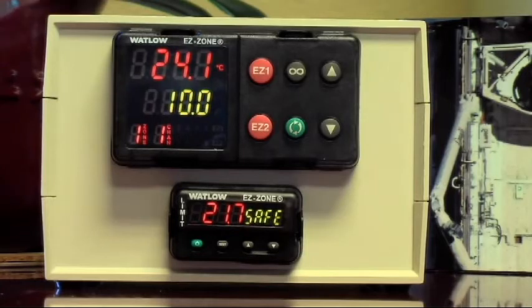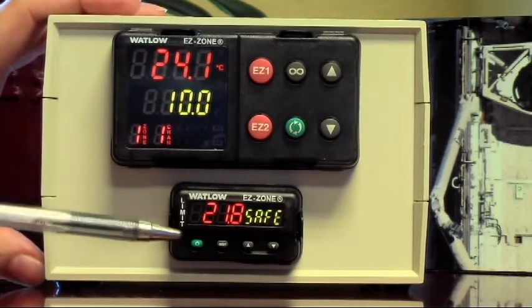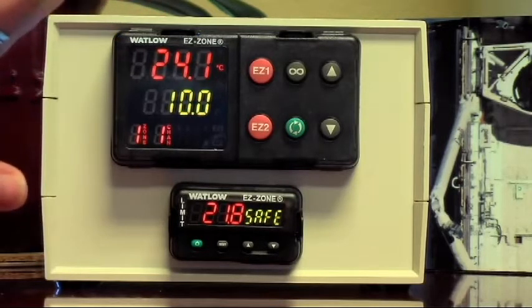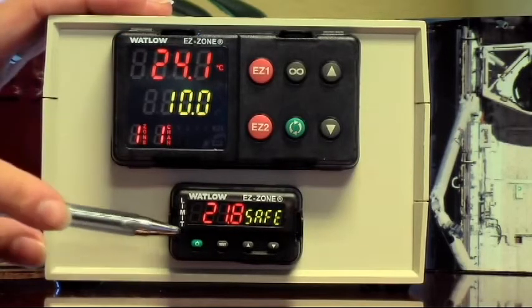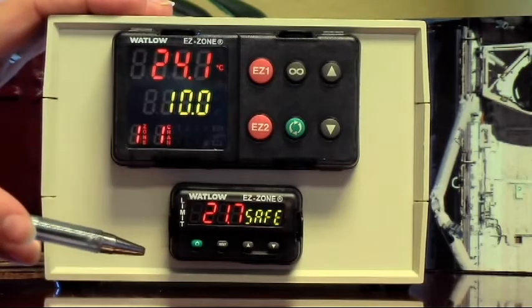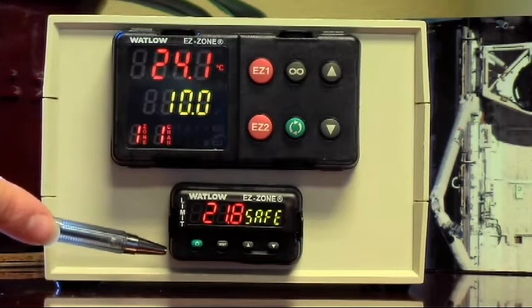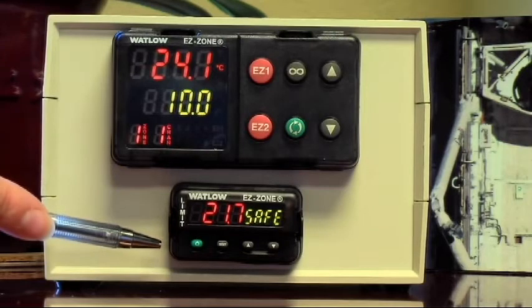What we have here is our Wattlow EasyZone controller and high limit, just like you would find on our vacuum ovens: TVO1, TVO2, TVO5. The first thing you should do when you get your oven set up and ready to go is set the high limit controller. From the factory, the high limit controller is set to the maximum temperature, which is 230 degrees C — so it's out of your way and it's not going to stop the oven at all. That's very hot, probably hotter than you want your parts to get.